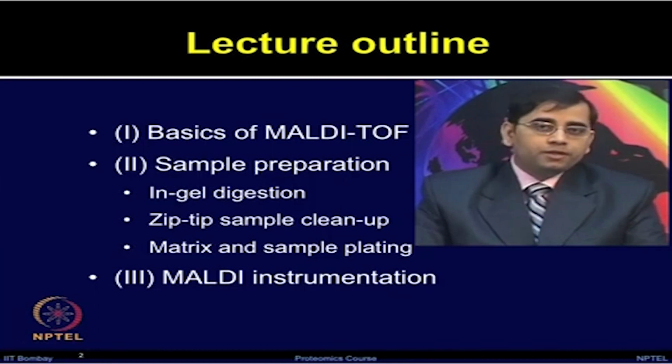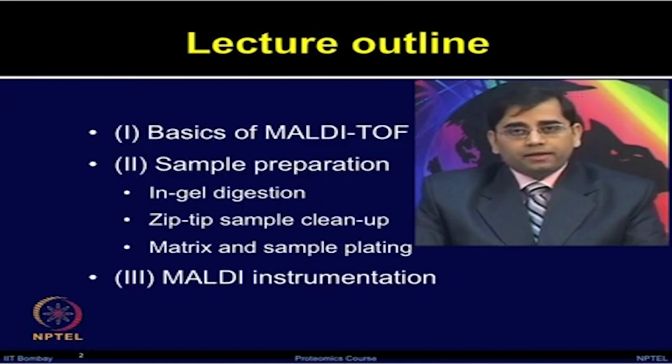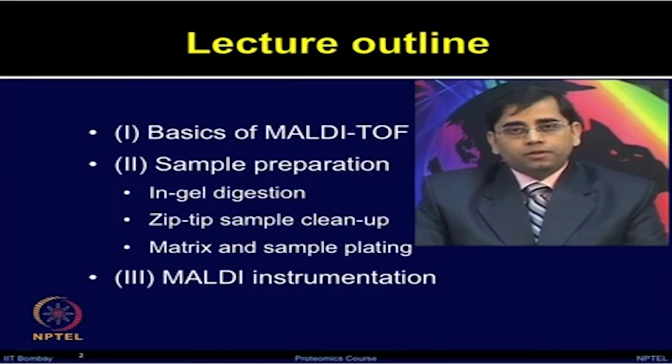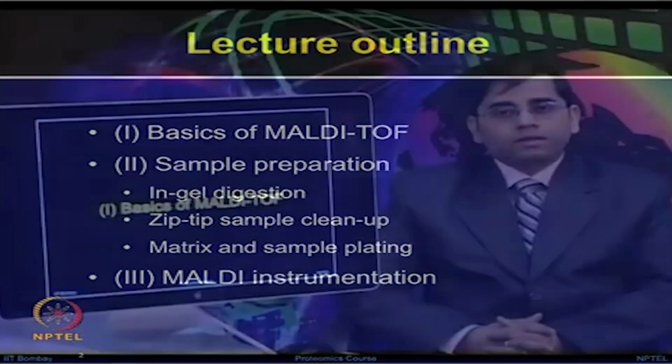You want to do the proteolytic digestion of the samples, followed by a cleaning up step, which requires a zip tip. Then how to prepare the matrix and place those on the sample plate. Then we will talk about MALDI instrumentation.